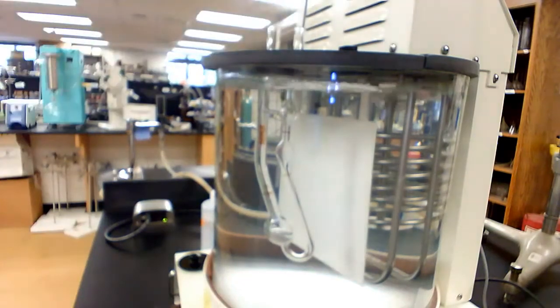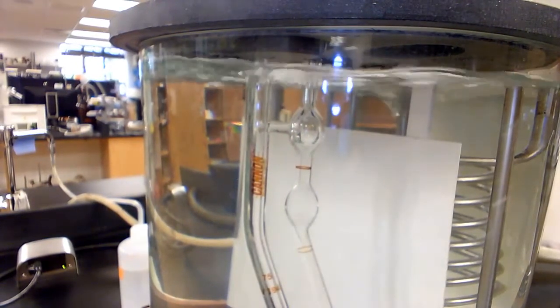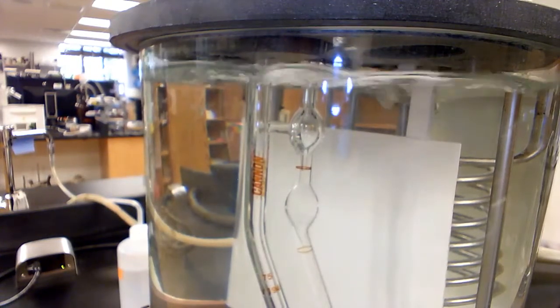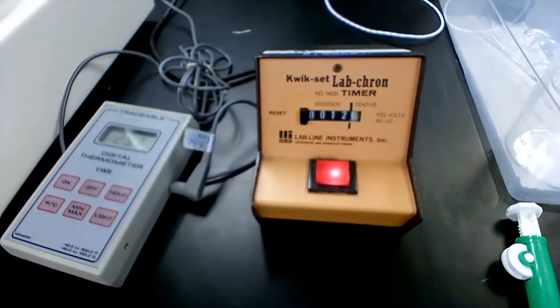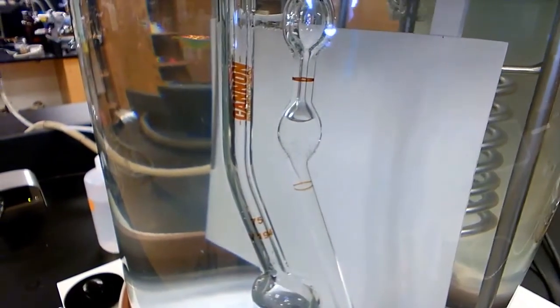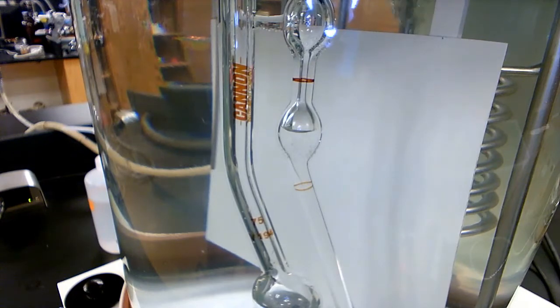Now I'm going to detach the pipetter and wait until the liquid reaches the top line before starting the timer. The liquid is now coming down — and stop. I've just started the timer, as you can see it is now running. We now wait until the liquid reaches the bottom line before stopping the timer. This measurement has to be repeated at least three times in order to find the average flow time of the standard water, which will help you find the B constant.